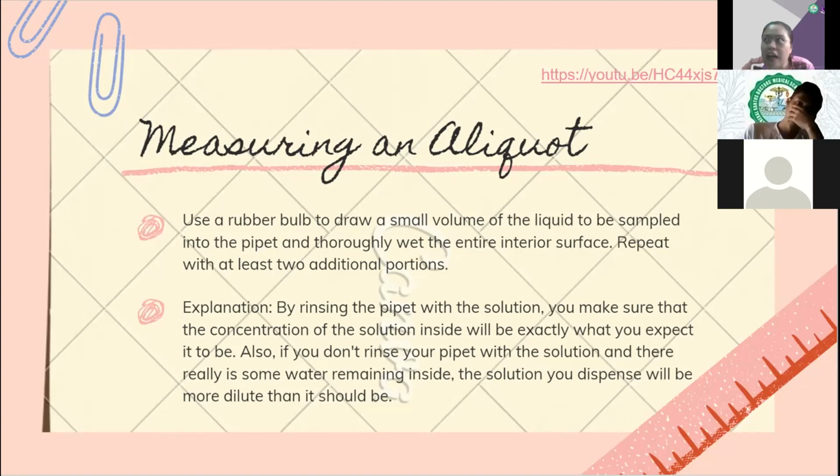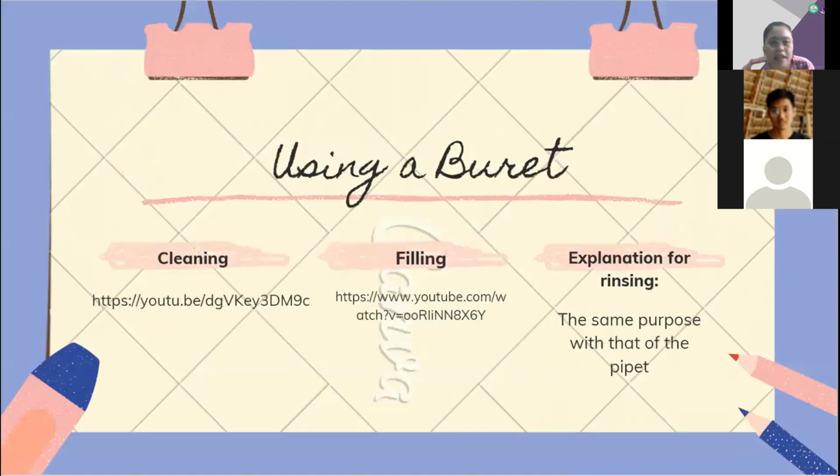Okay? So, just like sa graduated cylinder, when we measure volume of liquid using a pipette, we also follow lower meniscus kapag clear solution siya. So since mag-curve yung liquid inside, lower meniscus tayo mag-read again para sa clear. Pero kung turbid ang solution mo, higher meniscus tayo. Okay? Now aside from the pipette, we also have the burette.